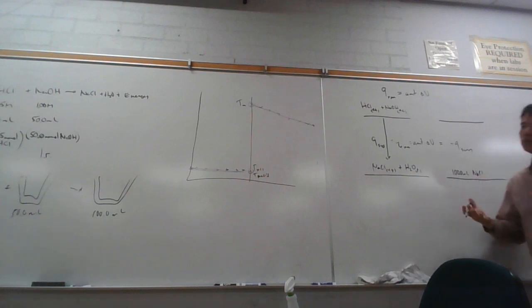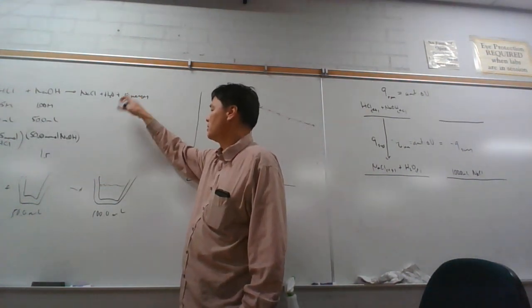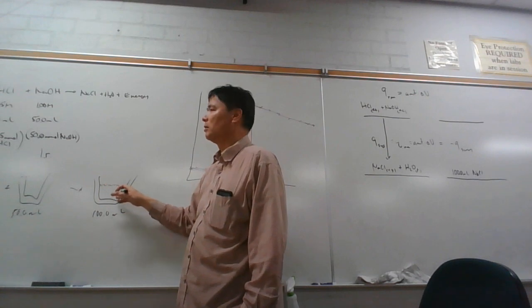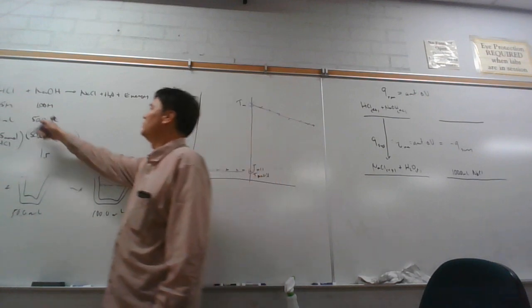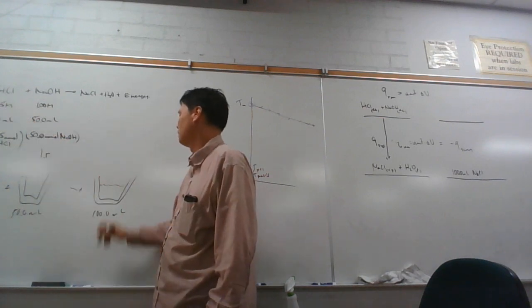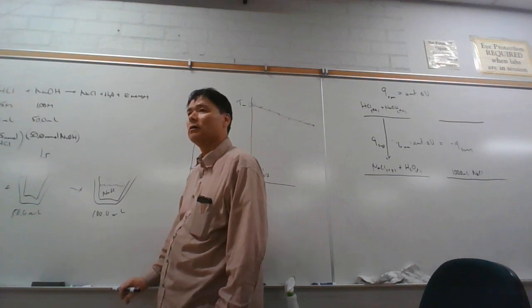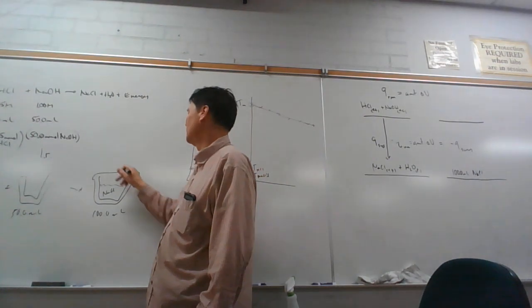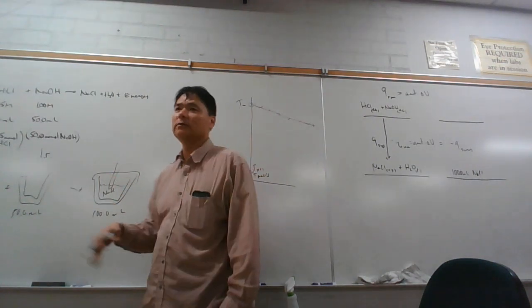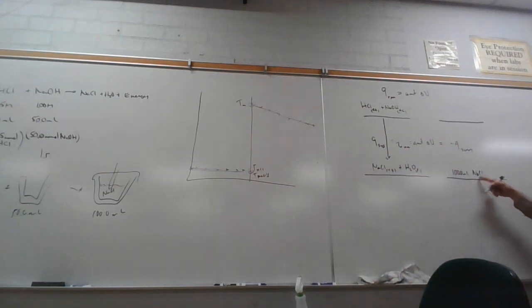And so that's going to warm up. All that energy that we get from this chemical reaction goes into warming up this sodium chloride, this salt water that I have left over here. Salt water plus a tiny bit of excess HCl. Does it go into warming up anything else? The cup, the lid, the probe, the air, which we call all the rest of the universe. In other words, we're going to have 100.0 milliliters of sodium chloride plus the calorimeter. We're going to call that whole assembly the calorimeter.